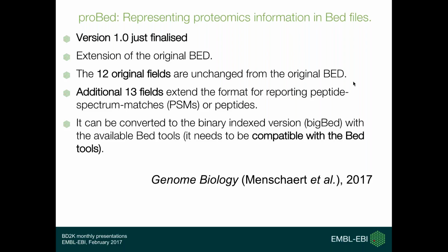You can read more about this. It was just published in Genome Biology, and we are now trying to export all of our data into ProBed to be consumed by our users.